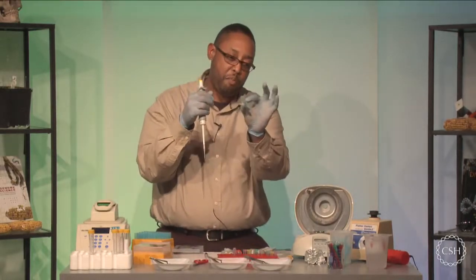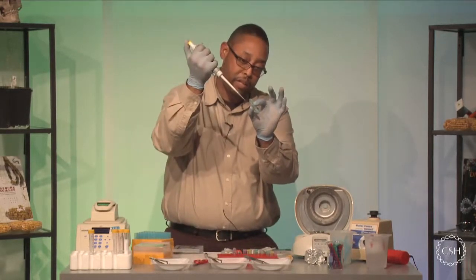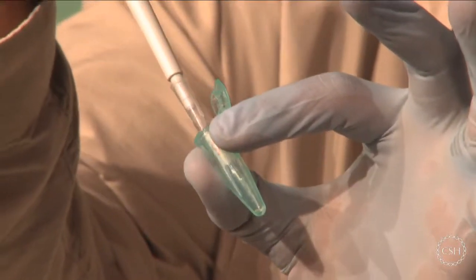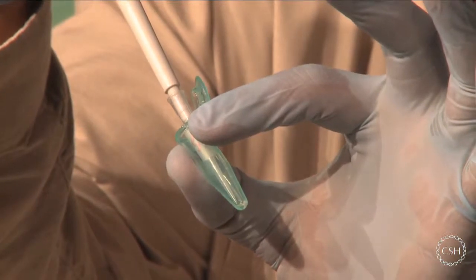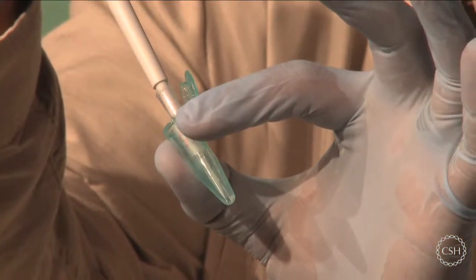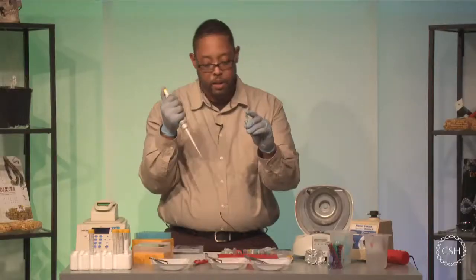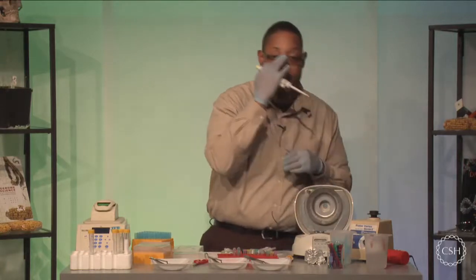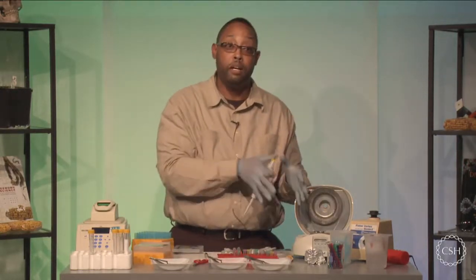As you can see here, you can probably see that there's a little bit of liquid still left in there. What I'm going to do is take my P100 tip and work my way down away from the pellet and slowly lift up the rest of that liquid. And then leave this open on the table. As I'm moving from sample to sample, depending on how many I have, my sample is actually drying along the way.